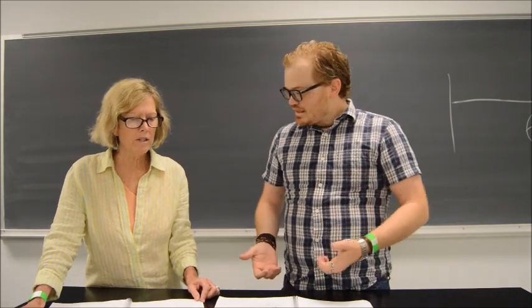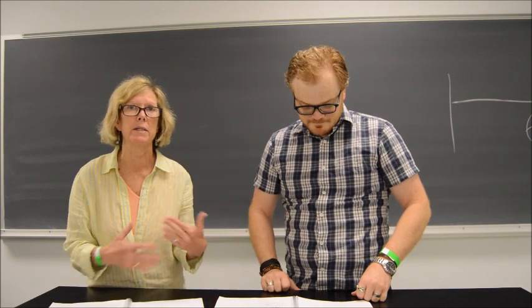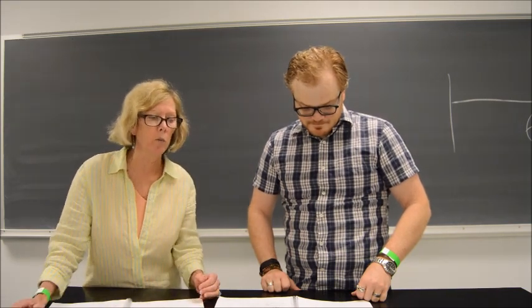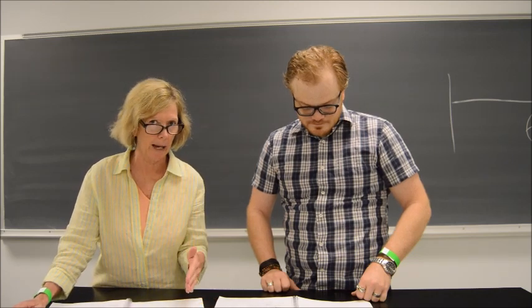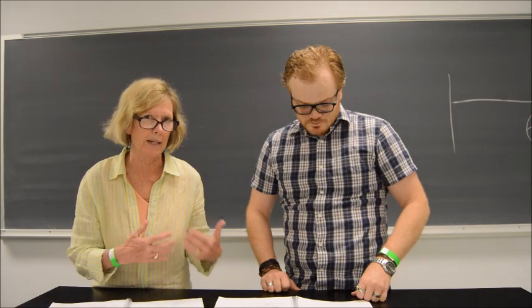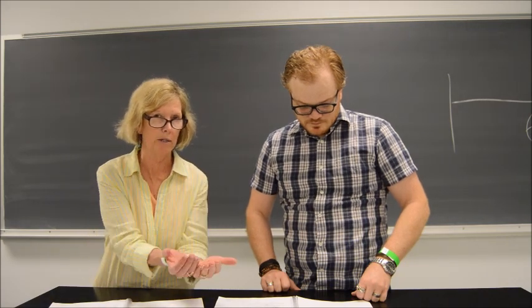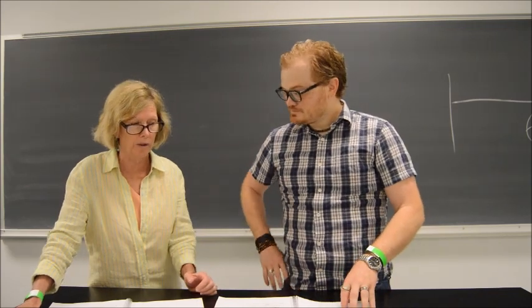Now, when you do this today, you're going to watch us make a lot of things, and we'll spend time in preparation, but we need to focus on the results at the same time, because when you go to have your lab test, the colors are going to be what's important to you. You won't be making things up. They will be made and you'll be shown test tubes. So pay particular attention to the results, to the colors that you get.